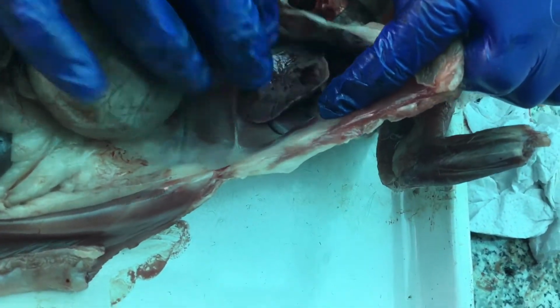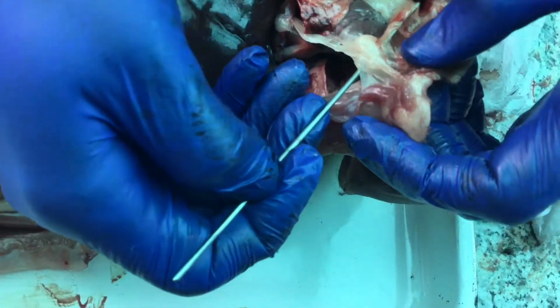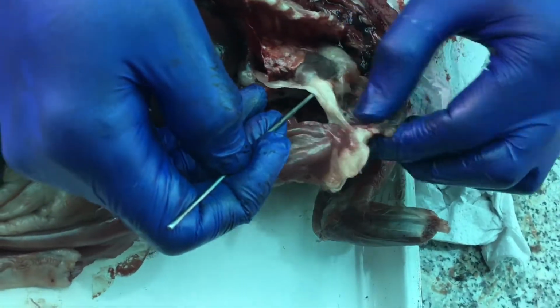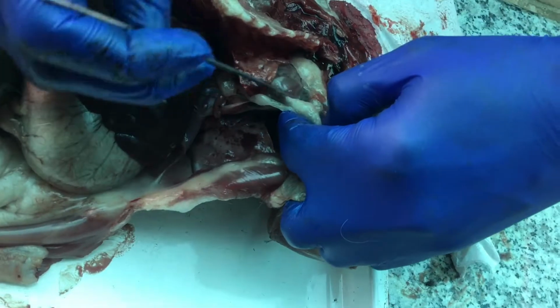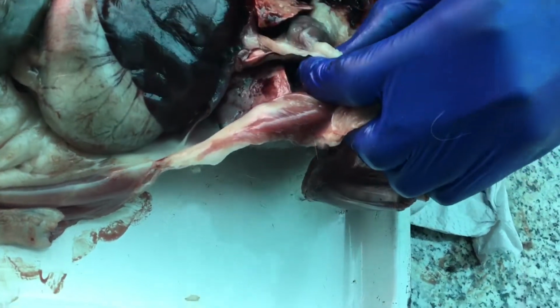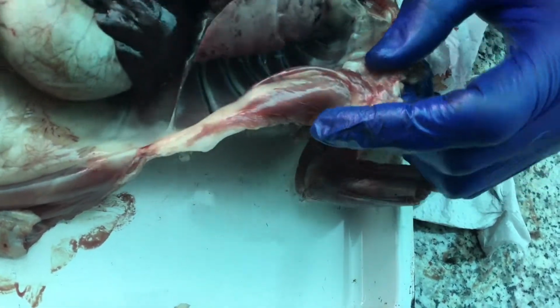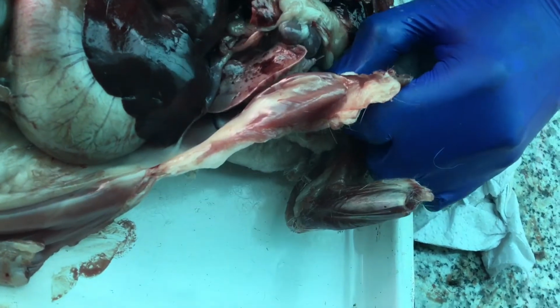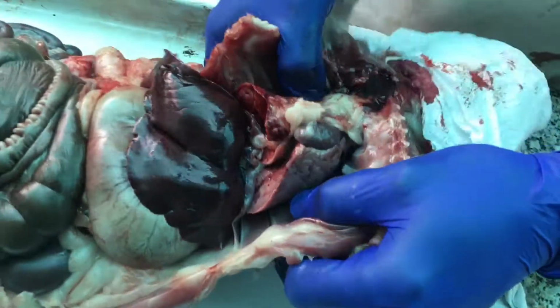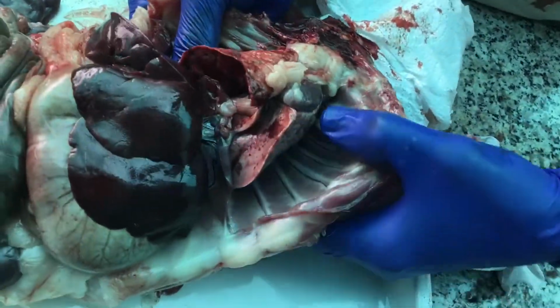There's my lung on the left side. And you can see the two sides of the chest cavity are separated by a ventral mesentery, a connection from the ventral or the anterior body wall right onto the surface of the heart, right down the middle. In order to really open up the chest cavity, I have to tear that away, and now I can see the entire chest cavity. If I pull back my ribs, I'm going to break the ribs back considerably so that you can really look in here and see the whole thing. So that's really nicely opened up like that.